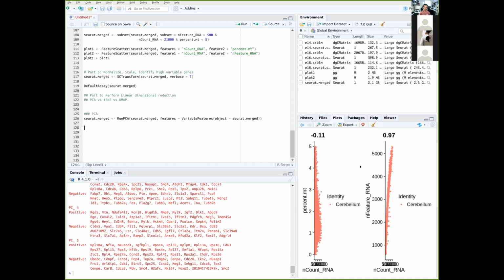So in order to plot the PCA or UMAP, it uses a function called DimPlot, for dimensional plot, and it plots the two principal components on a scatter plot. Essentially, that's it. There are a couple of other functions which also plot this dimensional plot, but they add additional information like expression. I'll show you that function in a bit.